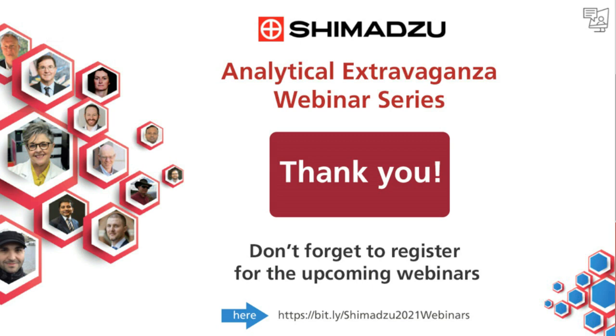Okay, thank you. And to all of you, if you have any questions that we aren't able to answer right here in the live Q&A sessions, please contact us and we will get you the answer via email. The next question is, can you repeat what columns you used for the chiral separation? That was the Restek cyclodextrin something? Yeah, beta cyclodextrin. I used Restek, normally I use Restek columns, but Supelco also provides them.